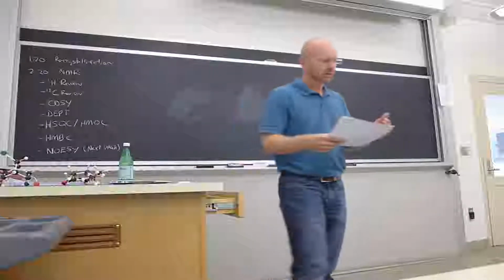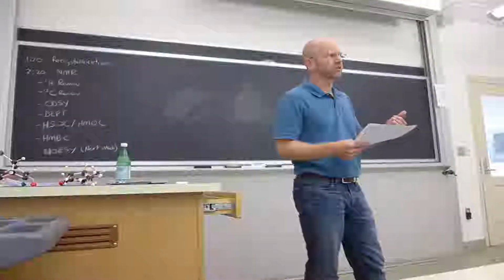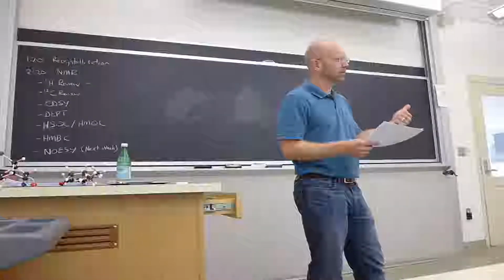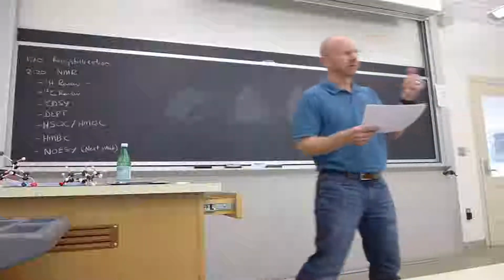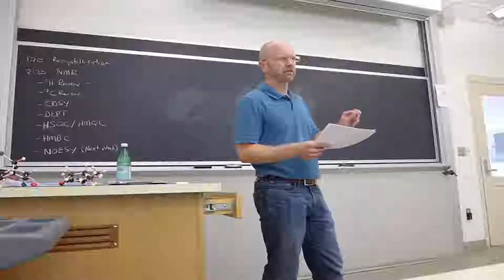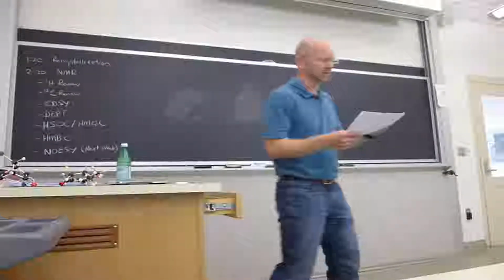Okay, so NMR, the primary tool of the organic chemist to figure out structure. So the first kind of NMR that you learned, who is familiar at least with proton NMR? Proton NMR. Okay, so we're going to talk first about proton NMR, and we're going to do it from a very practical standpoint. I'm not going to talk about theory today. It's just going to be practice. How do you get information out of spectra, essentially?